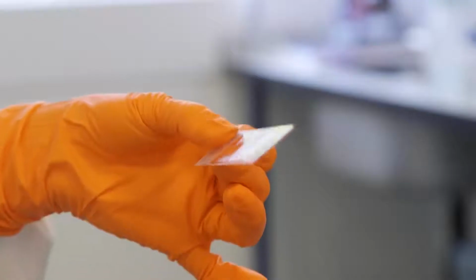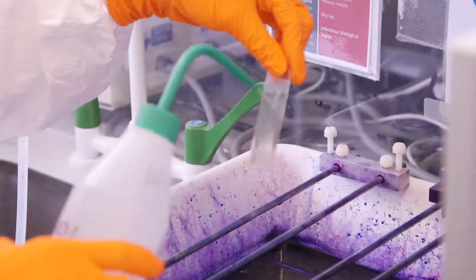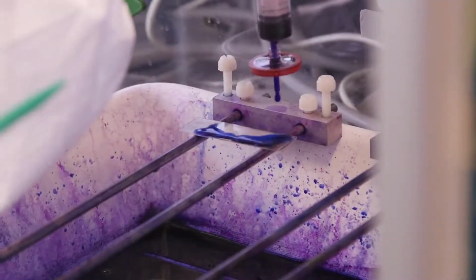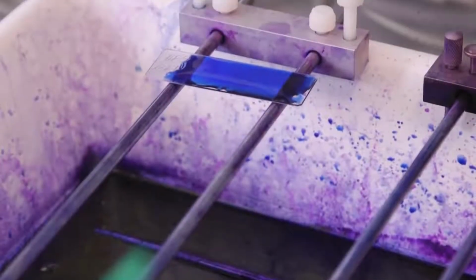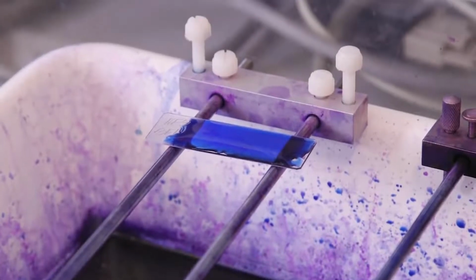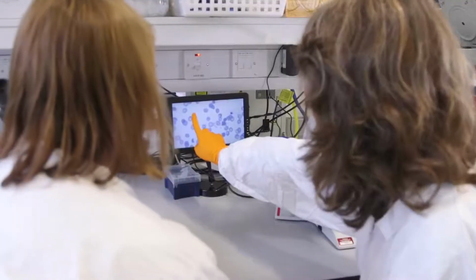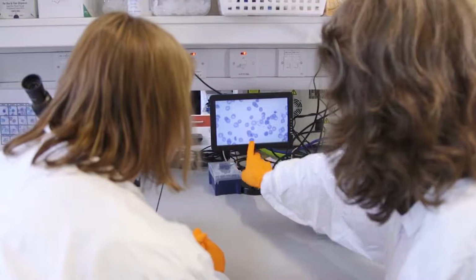We take a sample of the culture, we put it on a slide and smear it, let it dry, then the slide needs to be fixed and stained with Giemsa, which is a blue colorant that will allow us to see the red blood cells and the parasites on a microscope. On the microscope, what we look for is the stages of the parasite that are present in the culture.